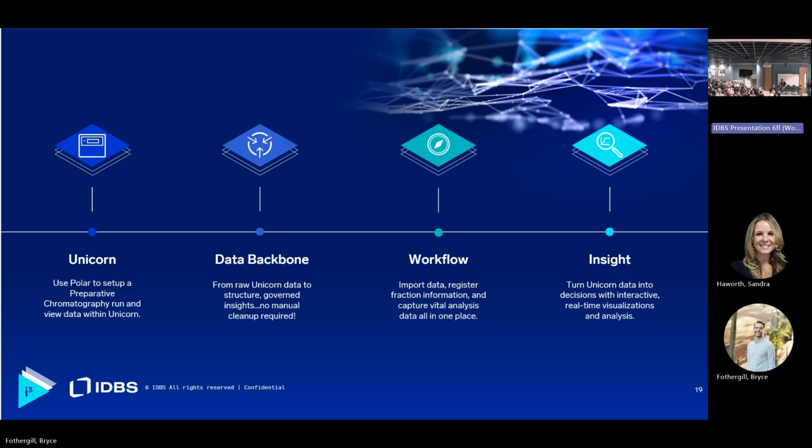I won't give you the exact number, but certainly a good few of our big enterprise customers are now doing that, and that's a deliberate decision they make to work with a third-party integrator. There are a few similar organizations to TetraScience that you can work with if you choose. Now, one thing to qualify on that is that it is an integration directly into our spreadsheet, right?